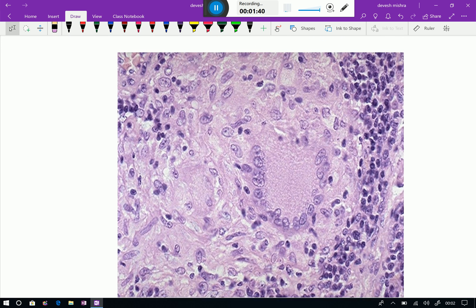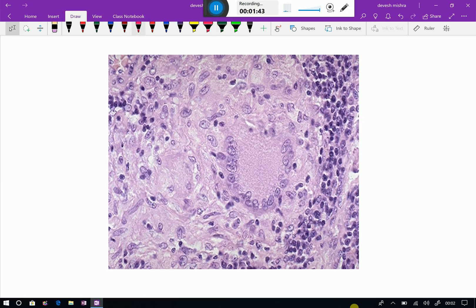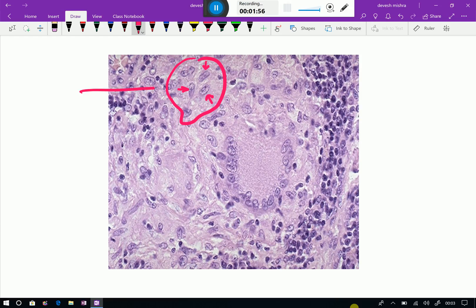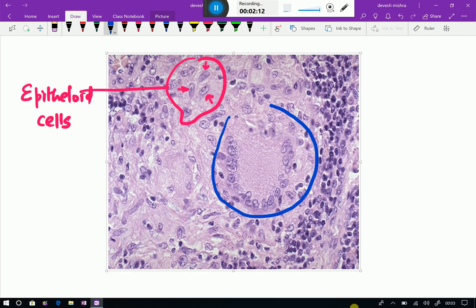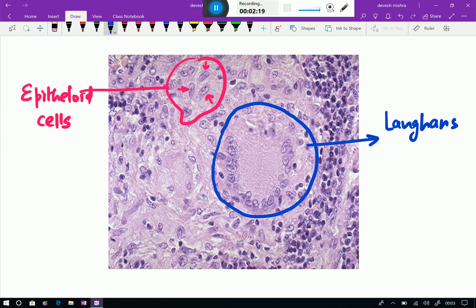Let us see the high power view, and this high power view is so beautiful — you can easily make it out. There are some cells which are elongated. You can see this one is an elongated cell, and this one is an elongated cell. All these are elongated cells — these are clusters of elongated cells which are epithelioid cells. Now have a look at this cell which I'm encircling — you can see peripheral arrangement of the nuclei. These are Langhans giant cells.